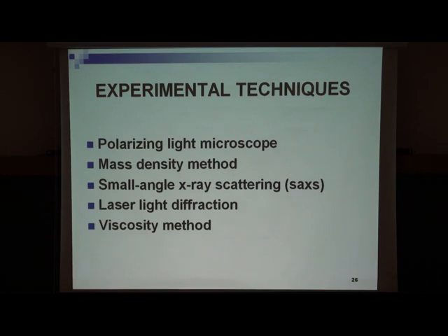Okay, in this study we used 5 different techniques. Polarized light microscope was used to describe textures of the samples, and in addition we used it to make conoscopy in order to understand the orientation of the phase director.